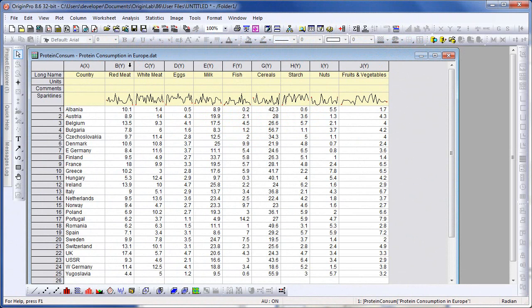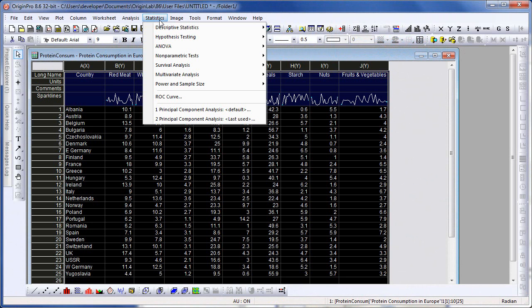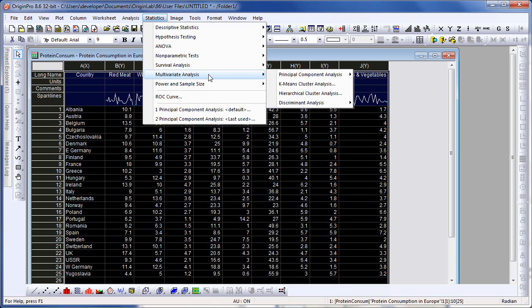Let me go ahead and highlight the entire worksheet and then click on the Origin Statistics menu. In Origin 8.6, we added a multivariate analysis submenu from which I'm going to choose Principal Component Analysis.